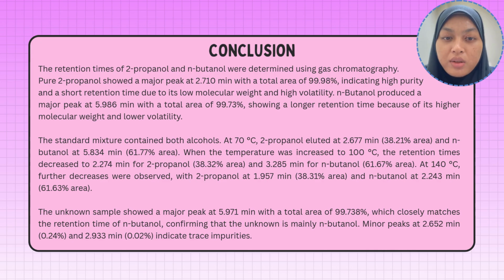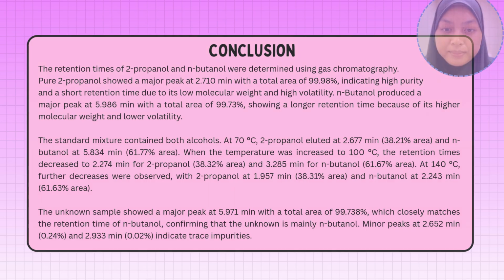The unknown sample showed a major peak at 5.97 minutes with a total area of 99.738%, which closely matched the retention time of N-butanol, confirming that the unknown is mainly N-butanol. Minor peaks at 2.652 minutes and 2.933 minutes indicate trace impurities.